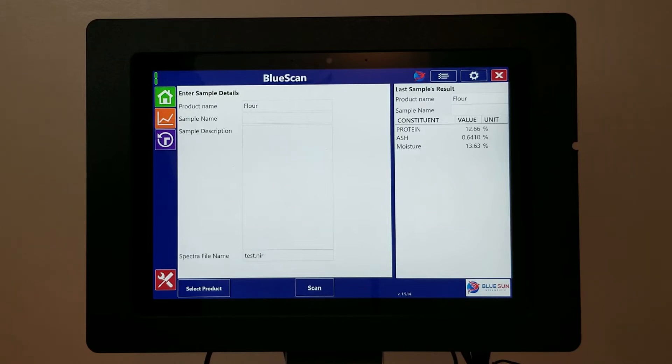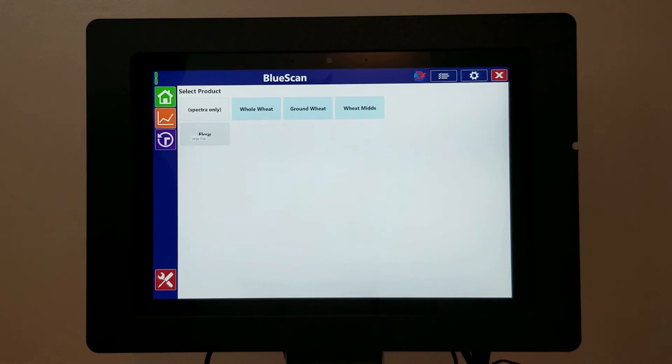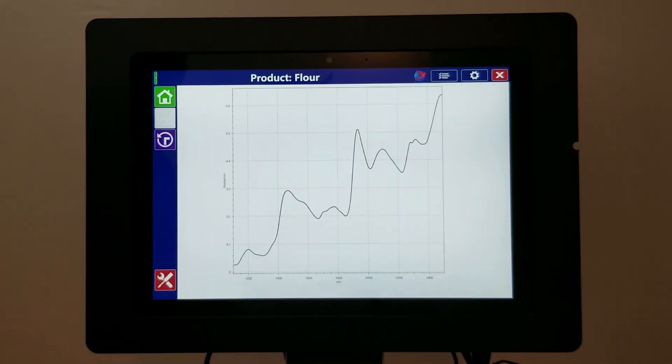The Phoenix 5000 software is easy to navigate. Daily operations are sorted into a four-tab design. The Home tab, where you can select products and perform scans. The Spectra tab, where you can view the spectra from your current scan.